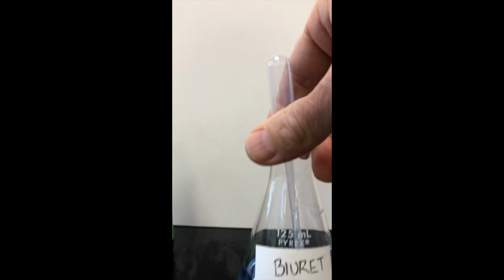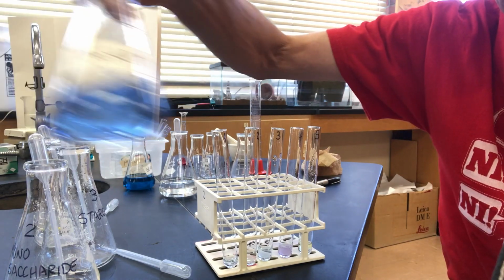The Biuret test determines the presence of proteins. The pale blue solution in the presence of proteins and high pH results in a deep violet purple color. This also happens instantly at room temperature.